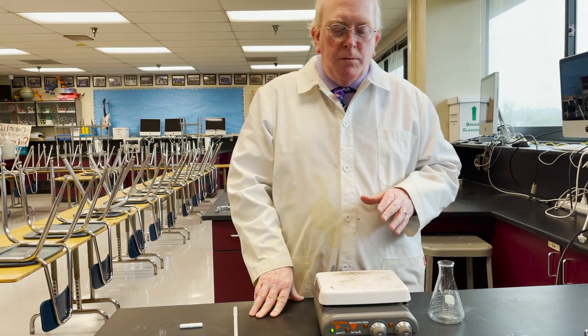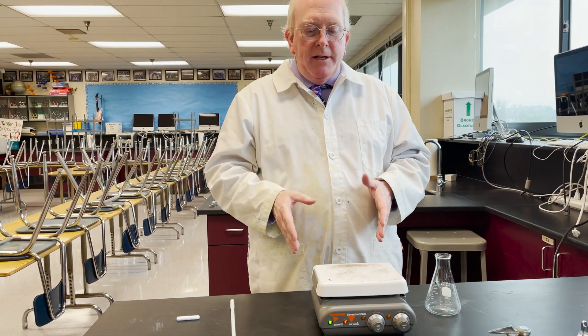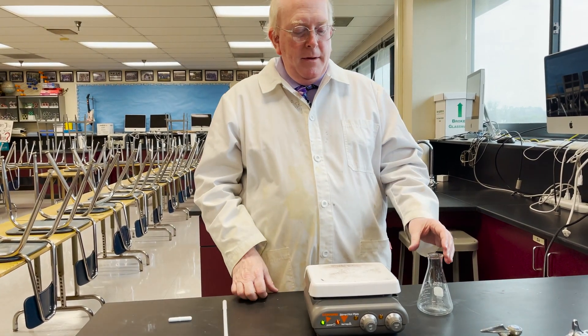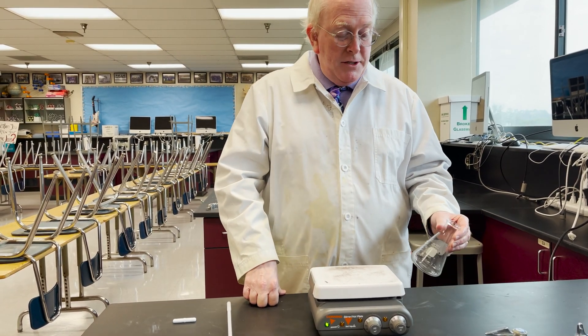This one also has a stirring feature, and we have stir plates that don't heat and stir plates that do. And even one lab in AP Chem where we need to use both at the same time — heating and stirring.